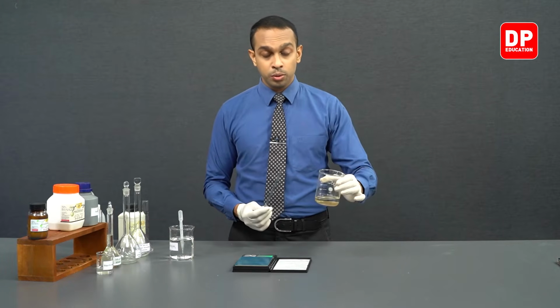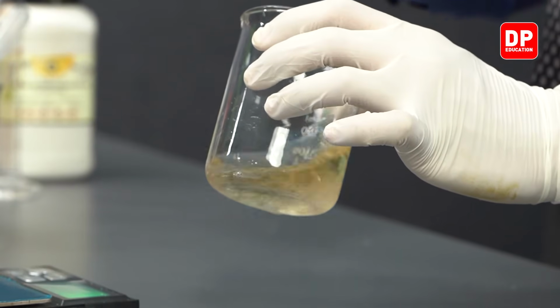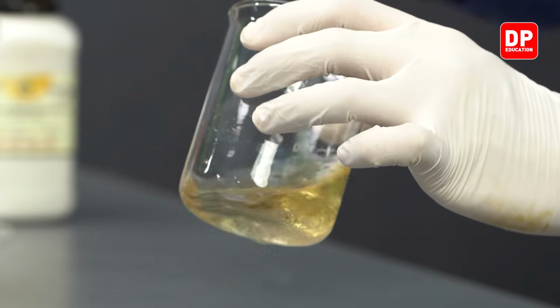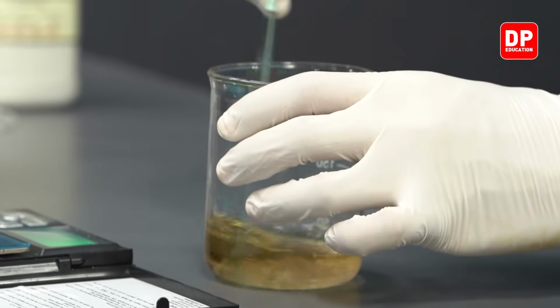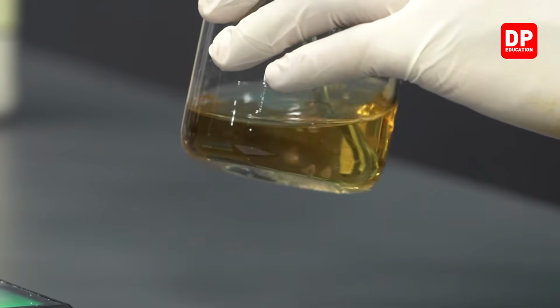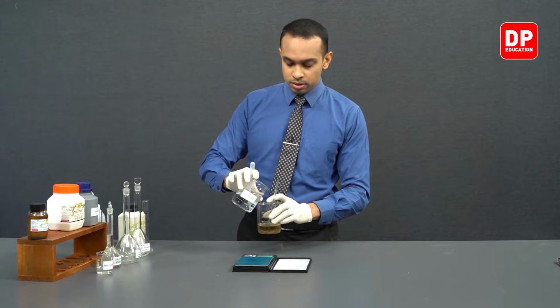After transferring it into a beaker, we can start to dissolve the ammonium ferric sulfate solid by stirring it. So we are dissolving the ammonium ferric sulfate in sulfuric acid. We can add a little bit more sulfuric acid.